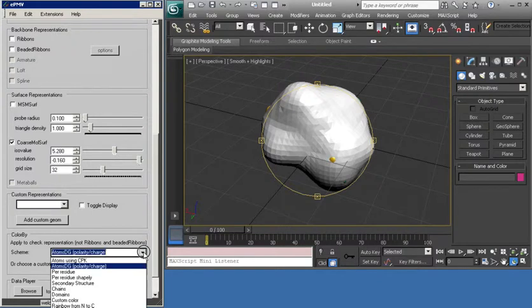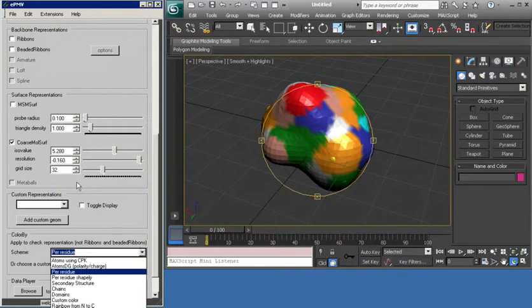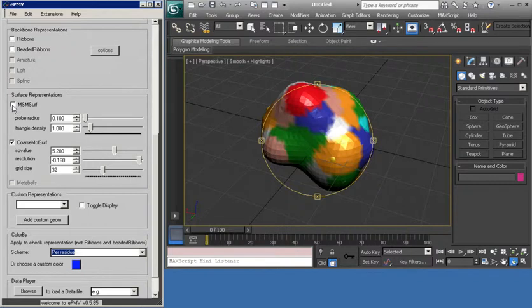But with these surfaces, all the same coloring schemes are available, so we can see where the residues would penetrate the surface. You can see that little yellow atom is still poking through, so the surface is colored with the area representing that yellow residue, because I chose to color per residue. Let's turn off coarse molecular surface and explore some other color variations. To do that, I think it'll be most informative if we go back to the molecular surface.